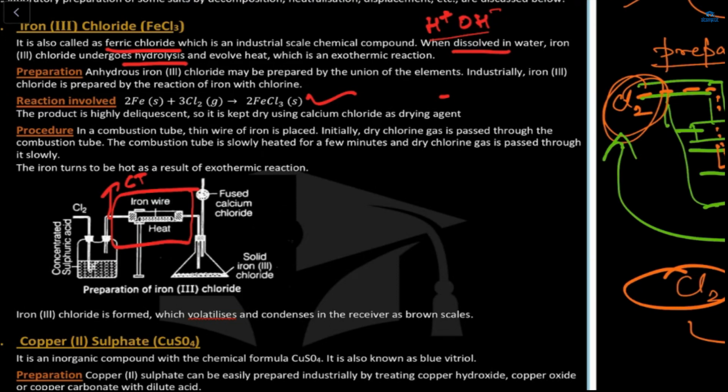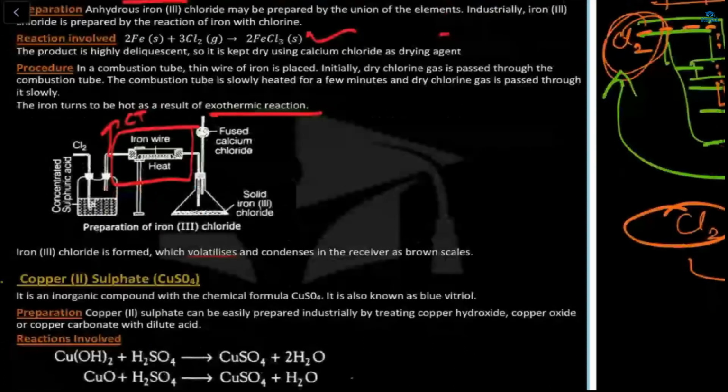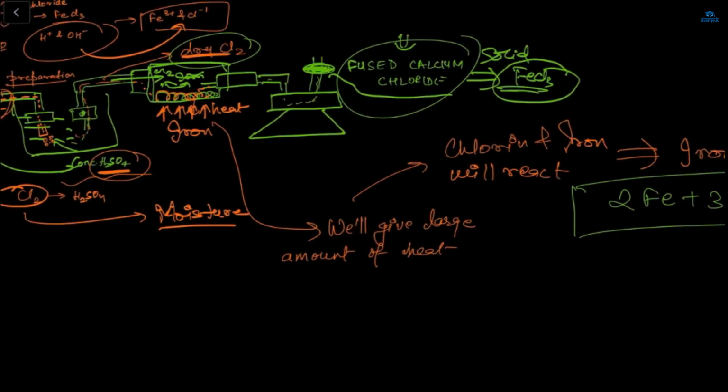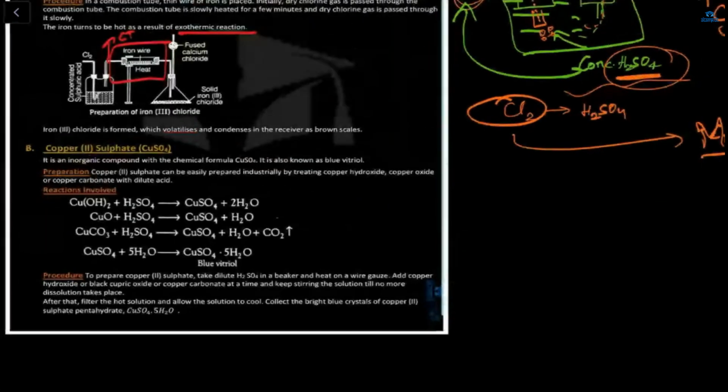The iron turns hot as a result of the exothermic reaction. When we heat the iron and the chlorine, the iron turns hot. So iron 3 chloride is formed, which volatilizes and condenses in the receiver as brown scale. This part is clear, right? If at the last some moisture is still remaining, then who will absorb it? The fused calcium chloride will absorb the remaining moisture and you will get solid iron chloride. Okay, so clear now? Yes, ma'am.